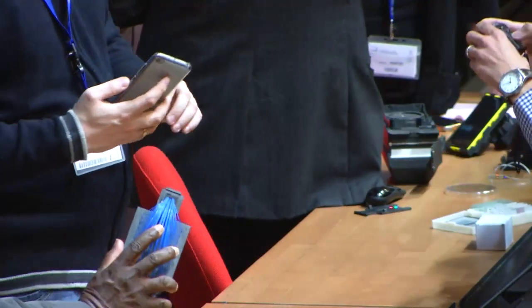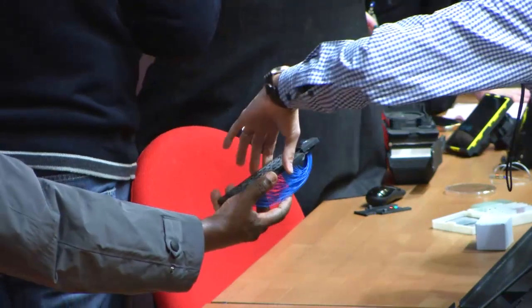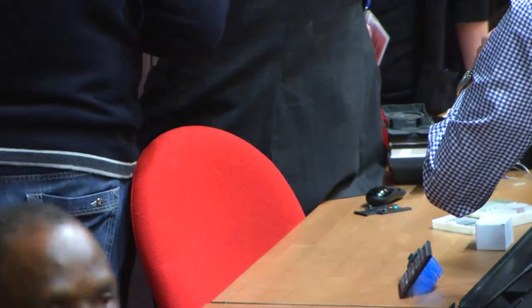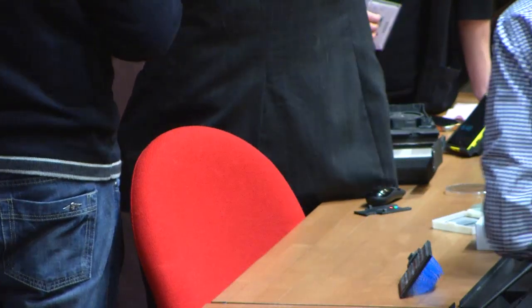And then this is really simple. It's a light cone. It's just a foil, and it just tries to keep as much light in there as possible. And then the piece of paper, which should be glued, is just a diffuser. So it's actually a very specific piece of paper. It's not any piece of paper. And so it gets a really uniform illumination.